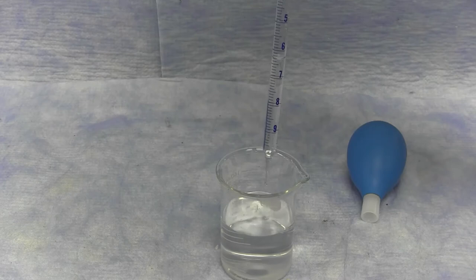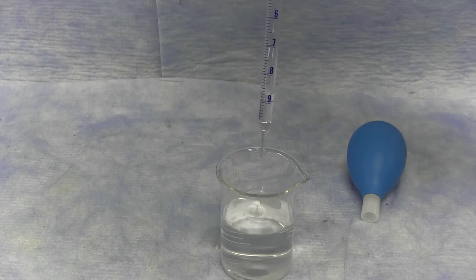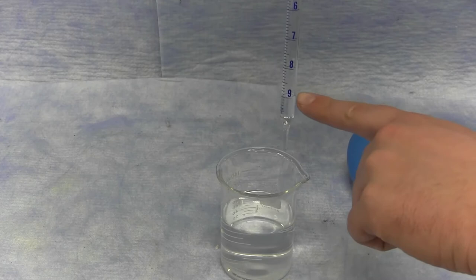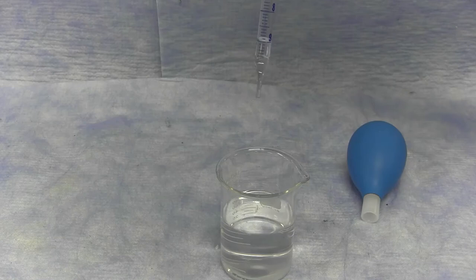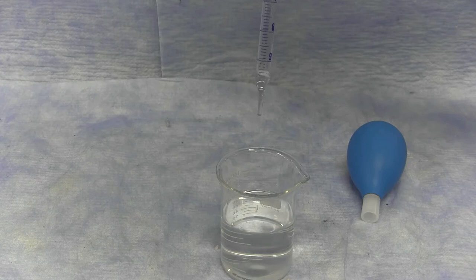Please note that just like the burettes, the graduations on a pipette do not go all the way down to the very tip. Therefore, you should generally stop at the 9 milliliter mark. There are a few graduations below that, but afterwards, the tip volume is not calibrated. The volume in the tip at the moment is unknown. And this does not mean that it is one additional milliliter.